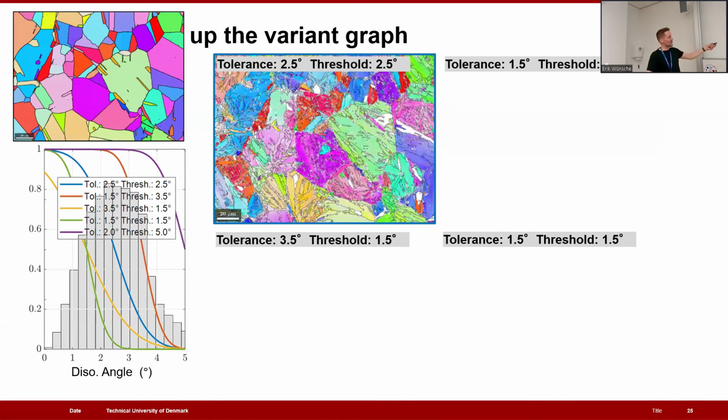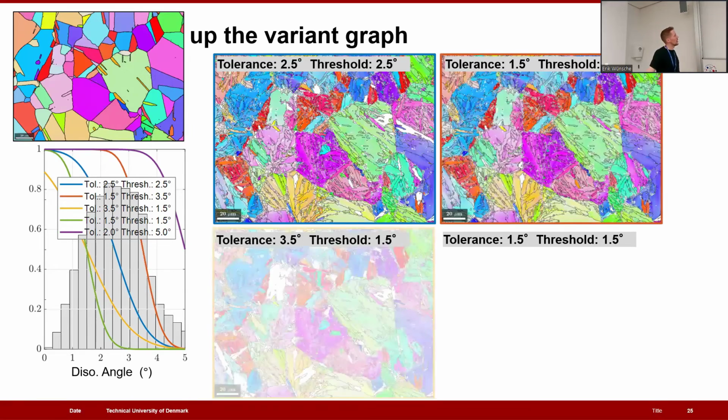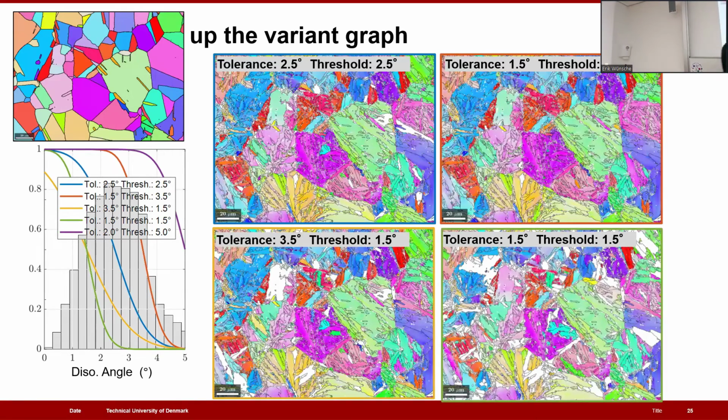So now let's look at which reconstruction result we get from these different parameters. We chose all the clustering afterwards to be standard and the same. We can see in those lower two cases that were not really ideal, the reconstruction also suffers quite a lot. This here was a standard parameter set, which gives us a quite okay reconstruction, I would say. Actually, this one gives a little bit better reconstruction because more errors have been filled with more confidence that this is the right parent orientation.